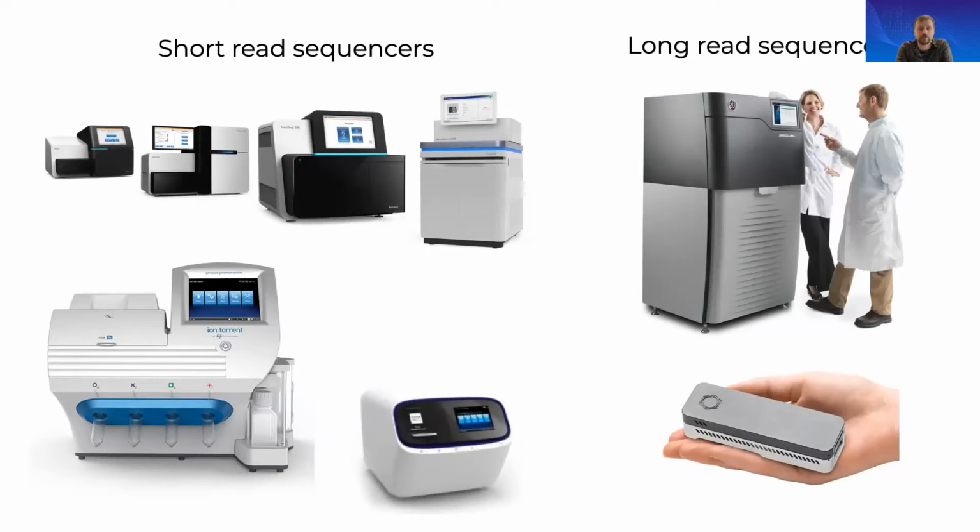Long reads, on the other hand, can resolve regions of the genome that are inaccessible to short reads due to repeat sequences. And so if you have multiple sequences that are exactly the same, you're going to run into a challenge of mapping. An alternative route is to generate longer reads. So the Pacific Biosciences technology can generate reads that are over 15,000 bases long, and some could be even over 100,000 long. At Oxford Nanopore Technologies, the platform, under the right conditions with high quality DNA, can produce reads of up to 1 million bases. So these are very, very long reads.